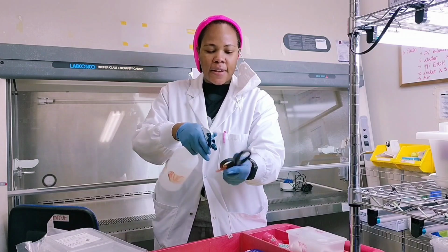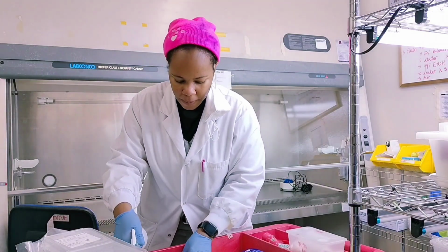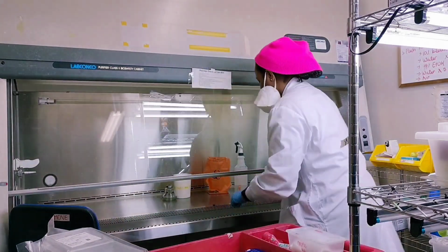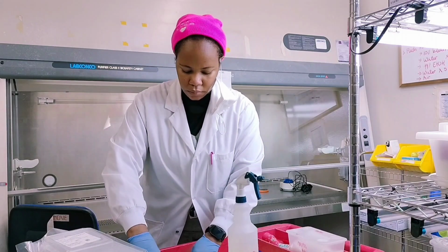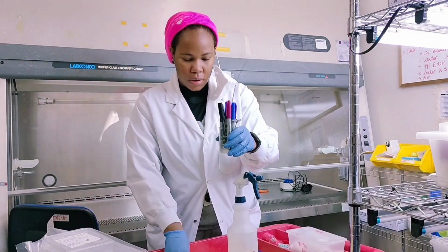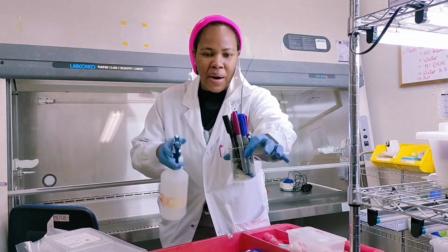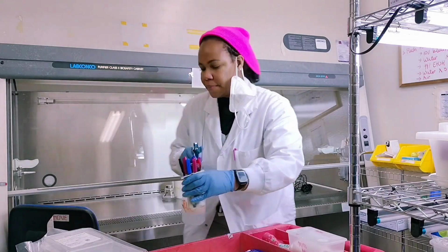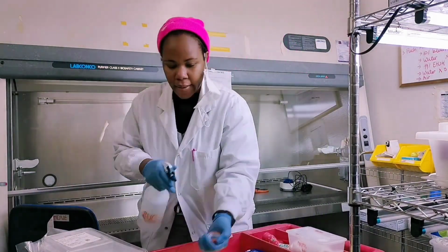I'm labeling the base of the plates along the periphery, then I amend the agar with tetracycline to kill any bacteria, and I just eyeball the volume that I pour into the plate. Then I put it to my left and let it solidify, which will harden it, and then stack them. This is what they look like when they're done. Beaker with my markers and some other tools. Tape.